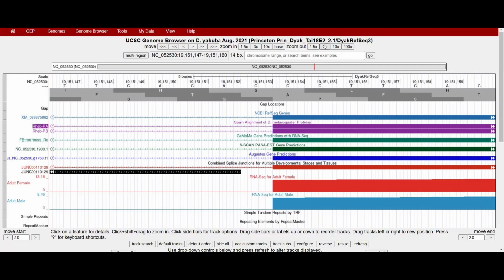data. There are 2 nucleotides, CC, at 19151154 to 19151155 between the first complete codon, TTC, and the potential splice acceptor site. Hence, this splice acceptor site is in phase 2 relative to frame 2. This phase 2 splice acceptor site is compatible with the phase 1 splice donor site for CDS2.